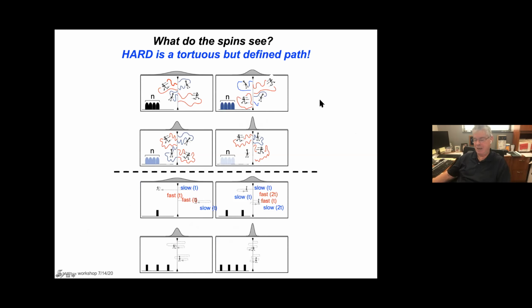So I'm going to come back to my track analogy, and I'm going to show this as, so the traditional experiments on the bottom, the CPMG, you can have the same analogy where you have fast and slow runners and they interconvert, but now they have very bizarre and tortuous paths depending on, here I've colored the shapes black, a blue, a lighter blue, and a very light blue. These are different adiabatic shapes, which means they have a different trajectory in each of these panels. The question is, these are going to carry that information about hopping between slow and fast, A and B, et cetera. But how do you understand that?